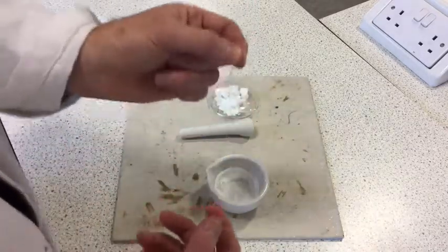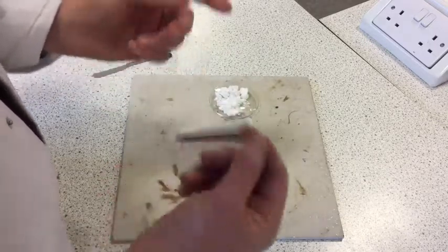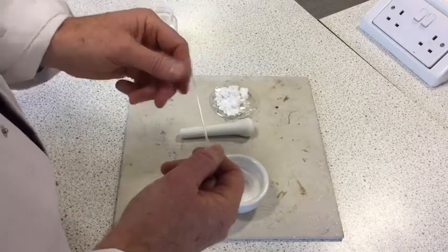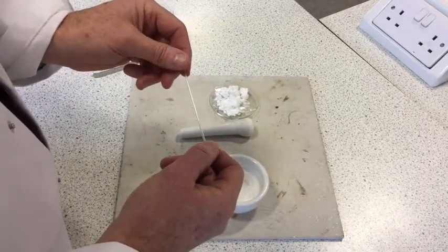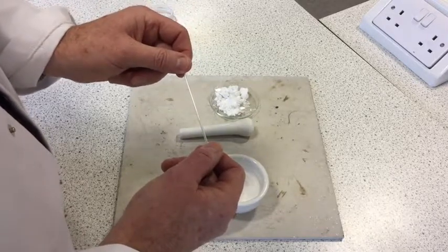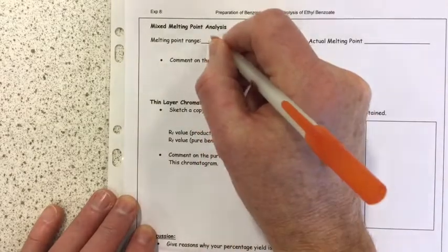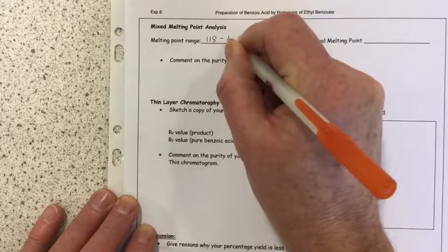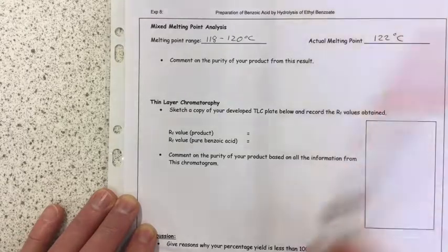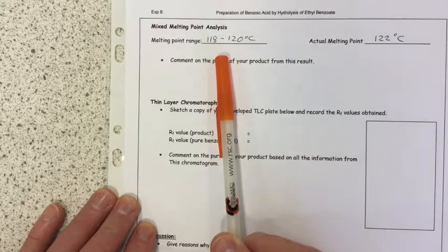Using a new capillary tube, transfer some of the mixed sample into it, do a melting point analysis, and if the two compounds are identical — the pure benzoic acid and what you've made — then once again the melting point range should be small and very close to our literature value of 122 degrees C. The results for my mixed melting point analysis were identical to my melting point analysis: I got a melting point range from 118 to 120 degrees C, with the actual melting point of course being 122 degrees C.